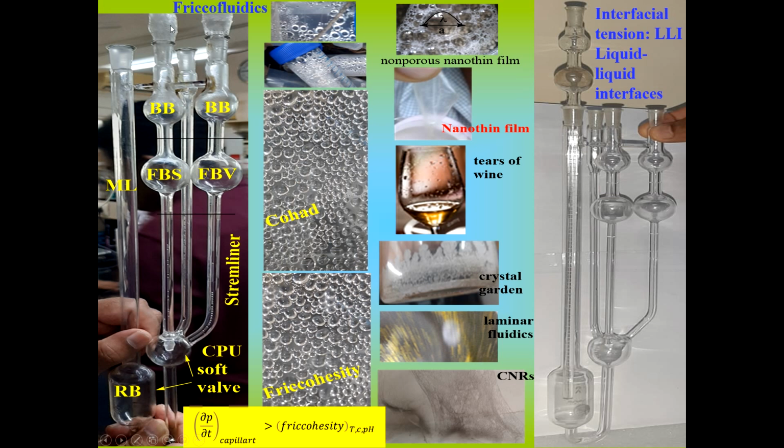So when we have to close these things, suppose I want to measure the surface tension, then because a sample is filled here, this sample acts as a soft valve or liquid valve, because it does not allow the air in the environment directly into the sample which is lifted to the side. So this is the viscosity unit. When the sample goes, one piston is fitted here to create this pressure gradient, we reduce the pressure, and to compensate this pressure, the liquid comes to this side, and this pressure is generated very slowly, so that there are no shocks and no mechanical defaults in the molecule.